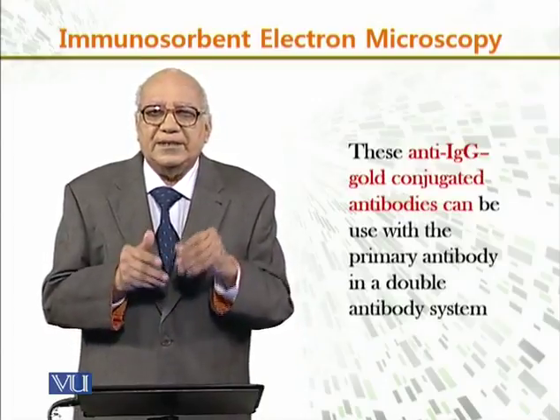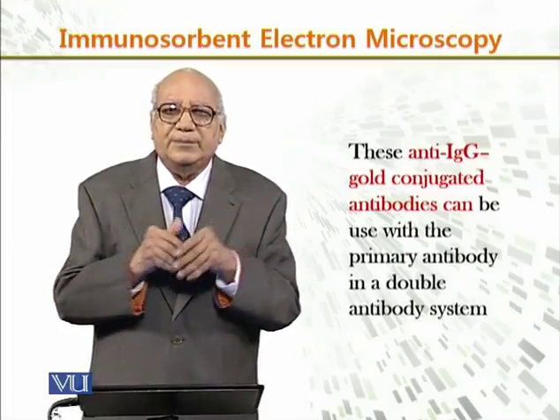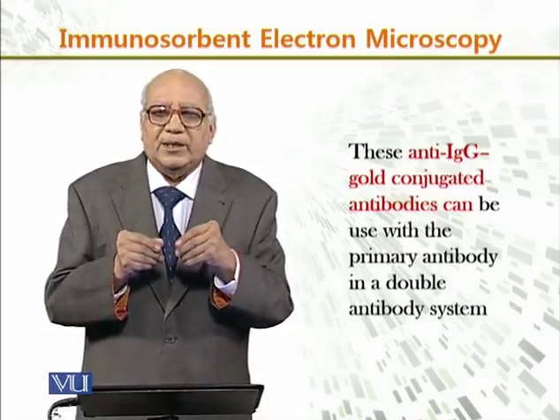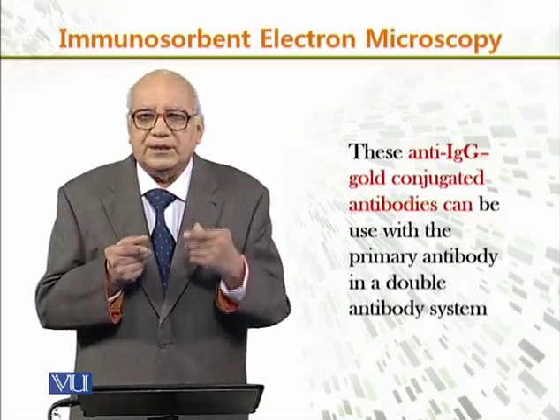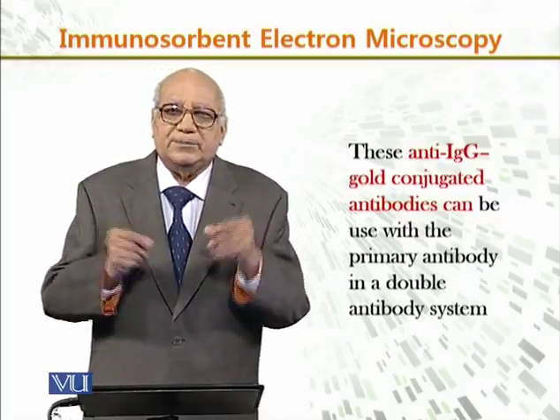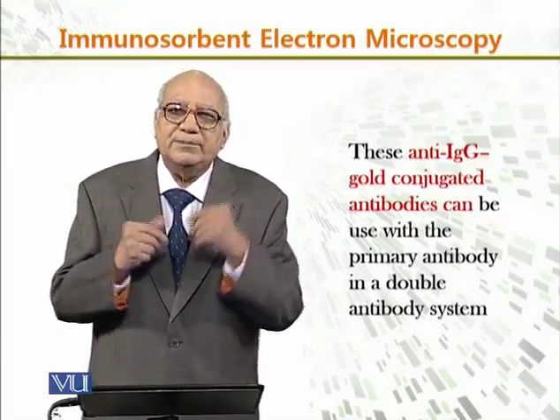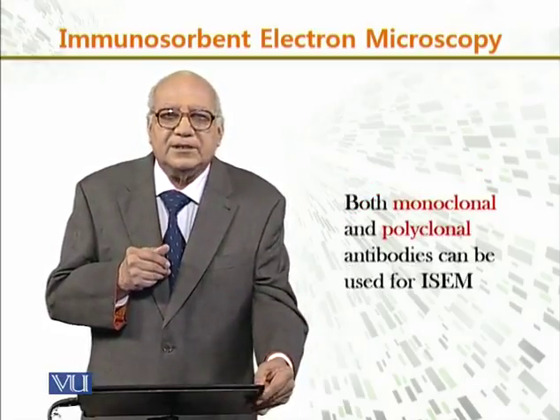Now, these anti-IgG gold conjugated antibodies can be used with the primary antibody in a double antibody system. So we can use a double antibody system, and these IgG gold conjugated particles can also be used with that primary antibody in that system.